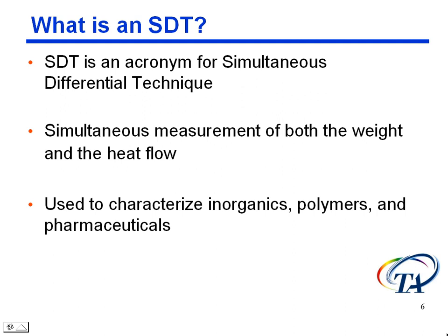Now, what is an SDT? SDT stands for Simultaneous Differential Technique. And what the SDT is, it's a DSC and a TGA, both at the same time. So with the DSC, we can measure heat flow. With the TGA, we can measure weight change. And so we can measure both of these at once, one instrument, one sample, run at the same time.